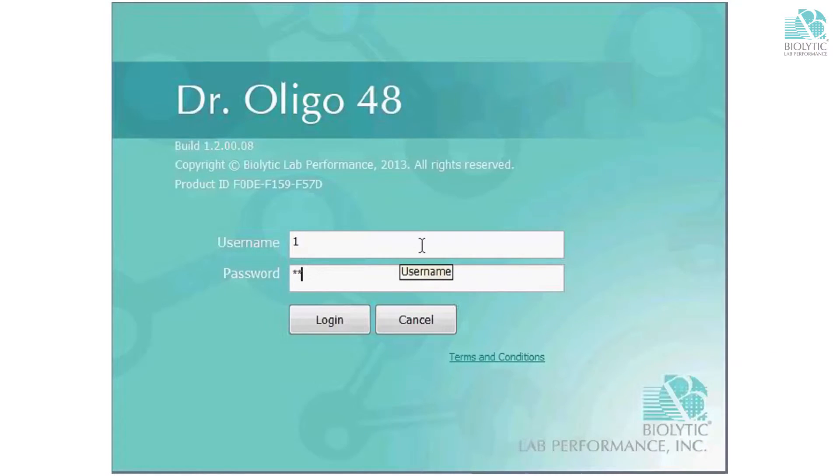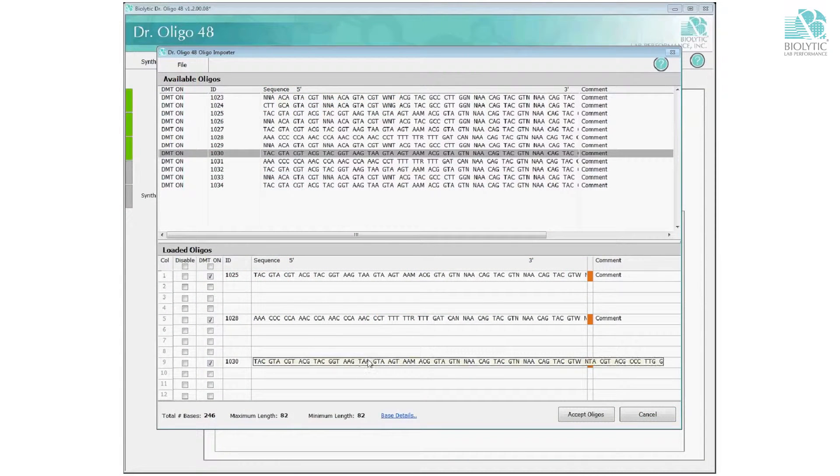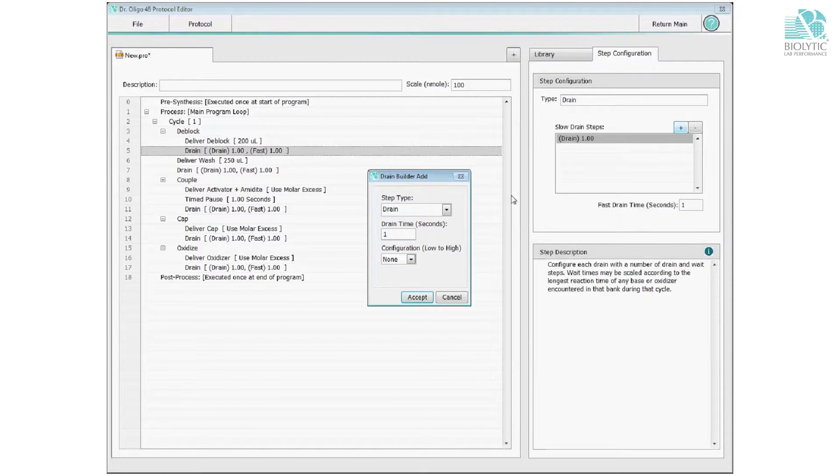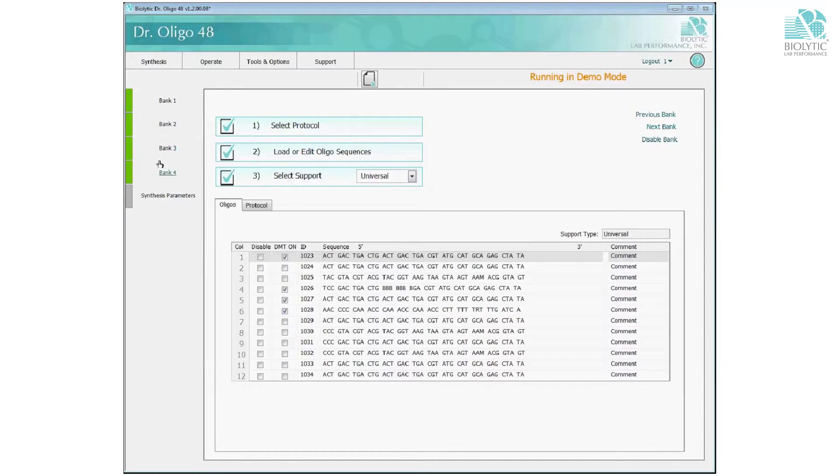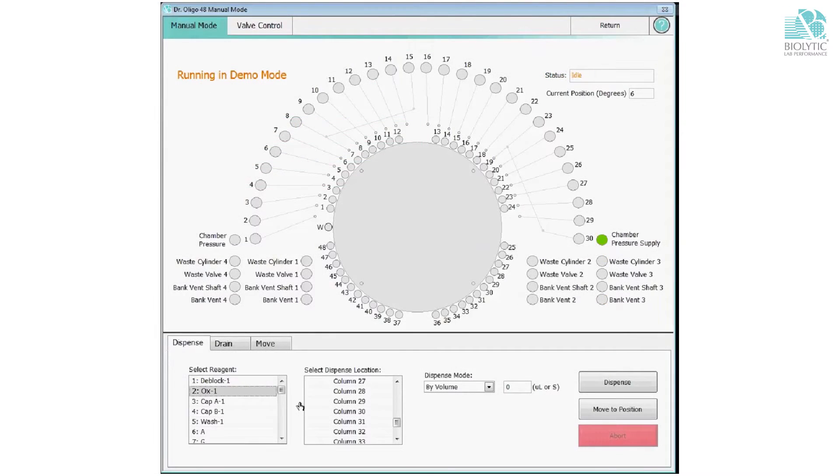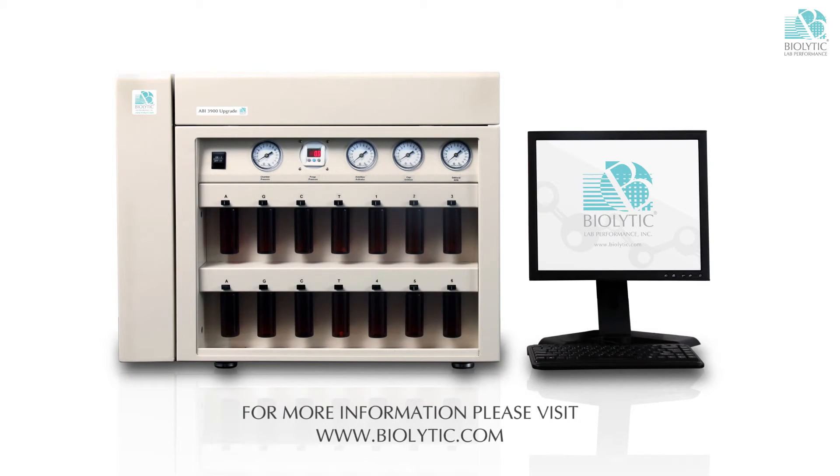Software was designed to work with this hardware. The software runs on Windows 7, Windows 8 and the software has a lot of capabilities in it that allow us to control these new slow drains very precisely, give us a better flow through the columns and change the functionality of different bottles. So that's our hardware upgrade.